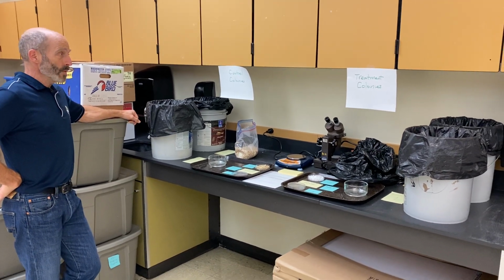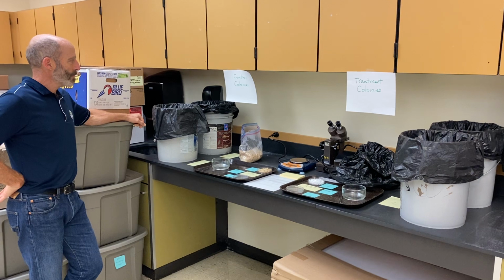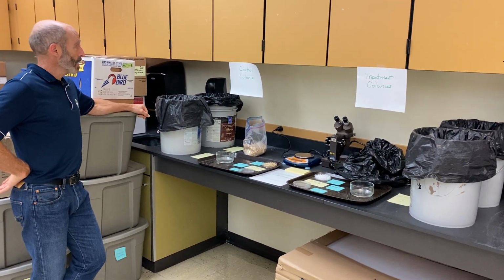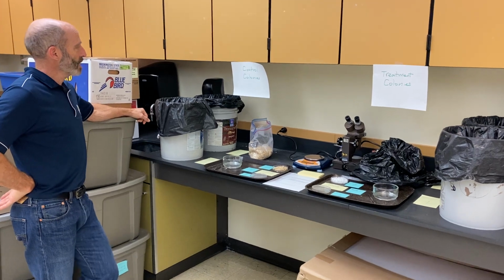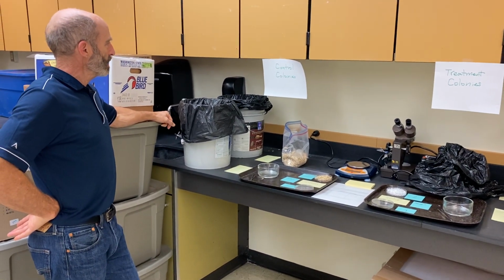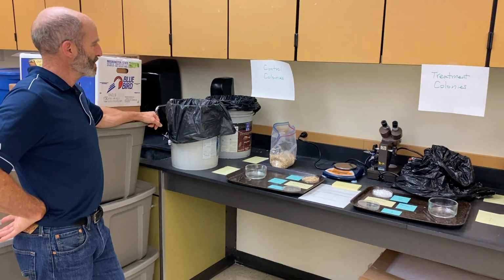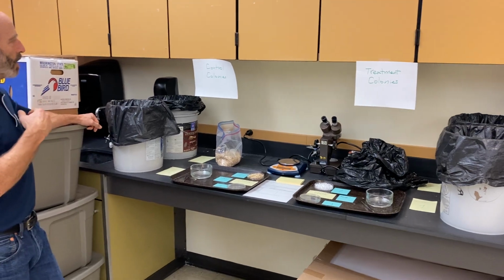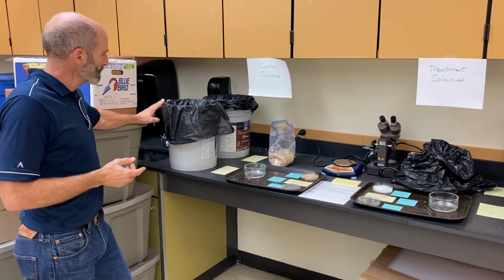But we set up earlier this year, as we should, to allow these populations, and in fact we have two different populations going on here at the same time. Once again, our study species is the mealworm. We have a population that we are in fact keeping the same to serve as our comparison contrast, and we call that the control colonies. We have two buckets of them.